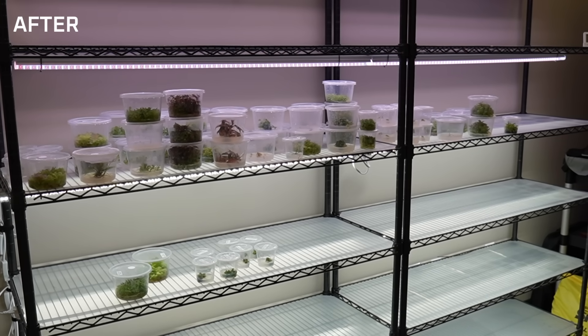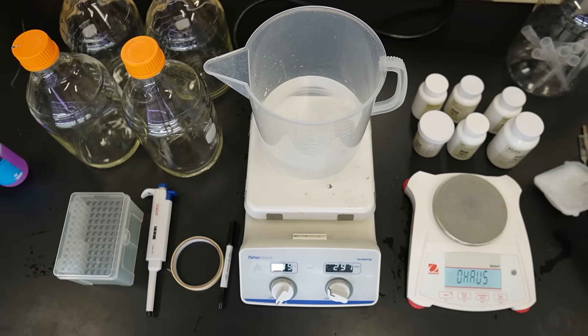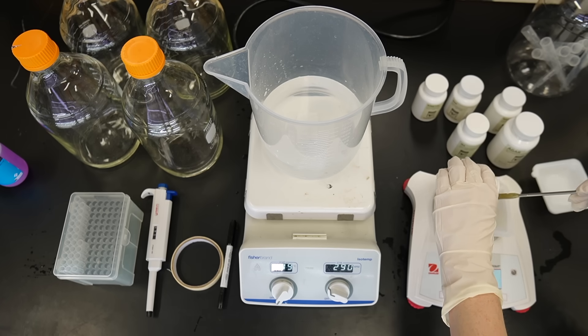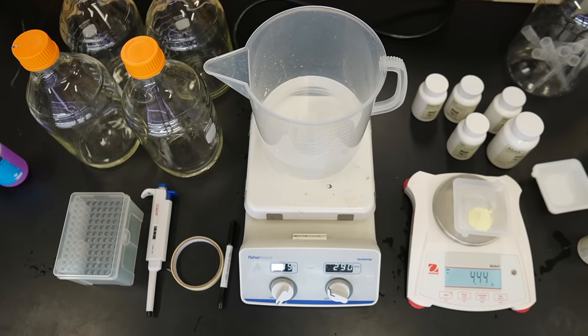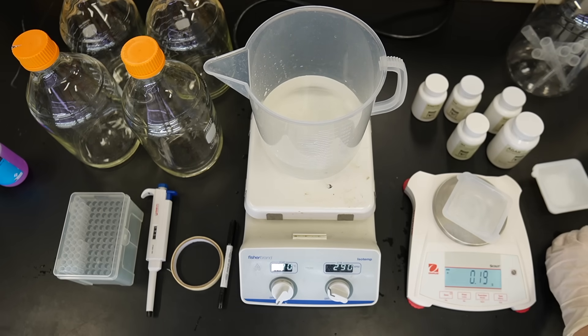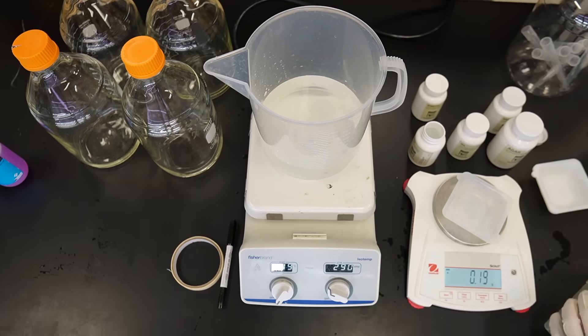Here's a before and after of the shelves — this is everything that I'm keeping. Almost all of it needs to be subcultured imminently. For this cleanout, I made one liter of philodendron media, one liter of begonia media, two liters of carnivorous plant media, one liter of African violet media, and half a liter of monstera media. If you're curious about the recipes I use for the different types of tissue culture medias, I have them all on my website, with the exception of the carnivorous plant one, which I'll put up on the screen.